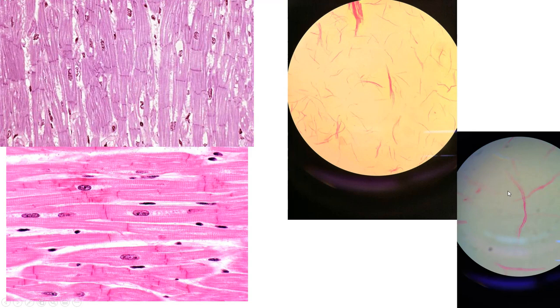Moving into smooth muscle, specifically this is teased smooth muscle, meaning the fibers have been isolated, and so it looks like a bunch of threads. If we zoom in, we kind of see a few like this. It has a fusiform appearance, fat in the middle, tapered on the ends. That's what teased smooth muscle will look like.